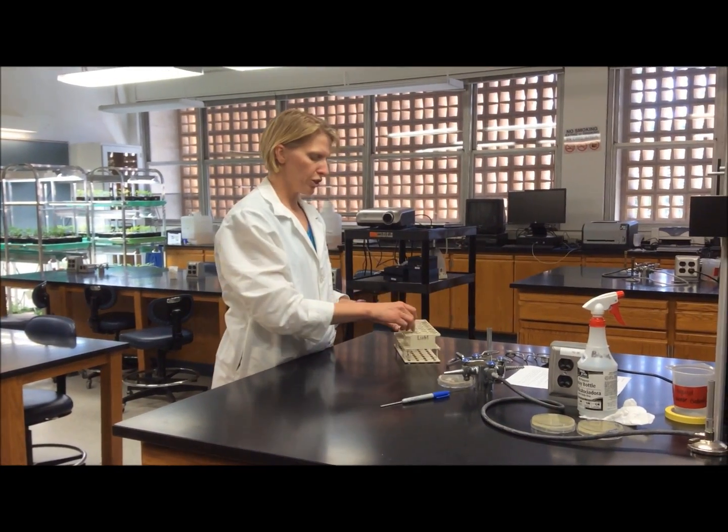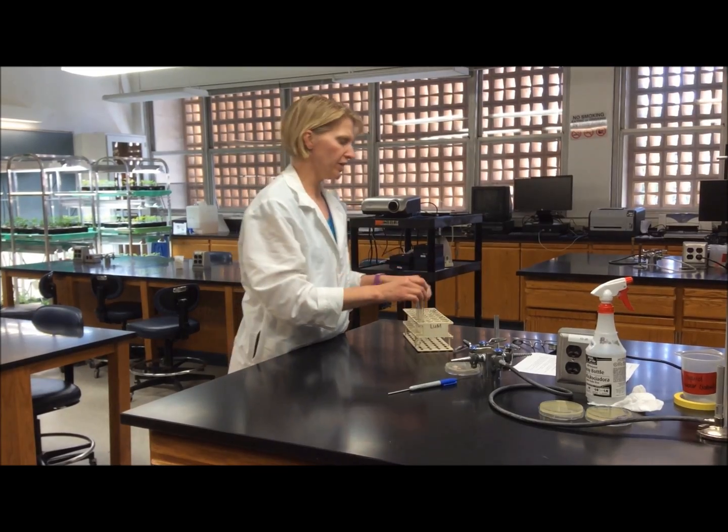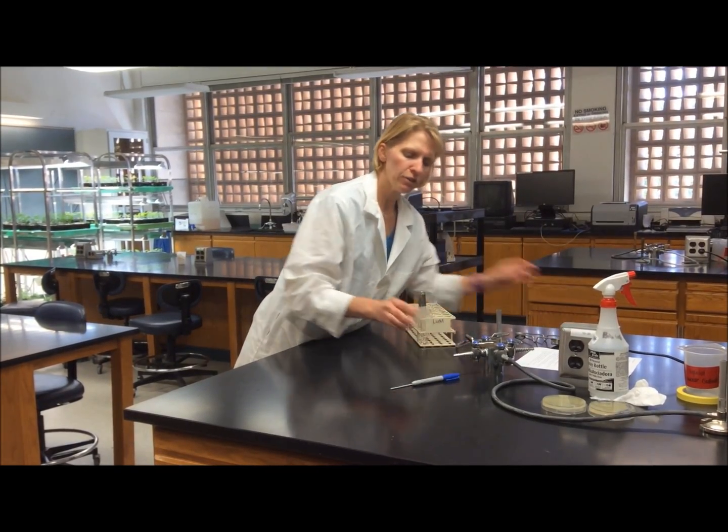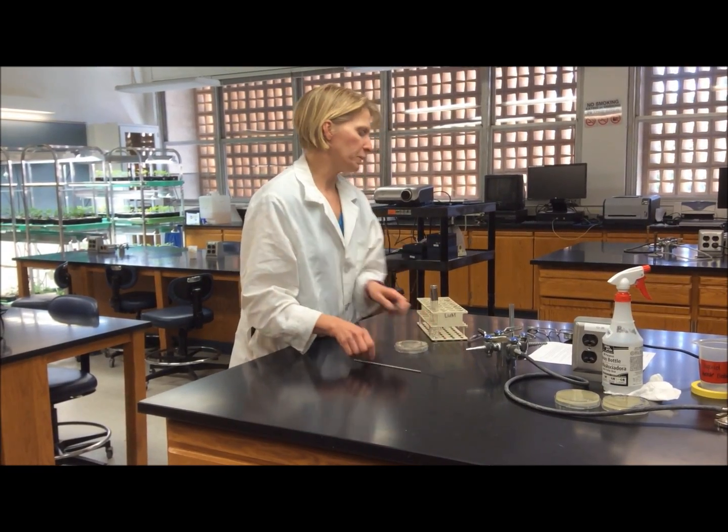To make a liquid culture, you will need a tube of liquid media that will sustain the growth of your bacteria, as well as your culture that you want to inoculate, and an inoculating loop.